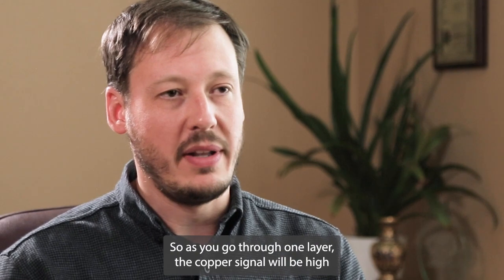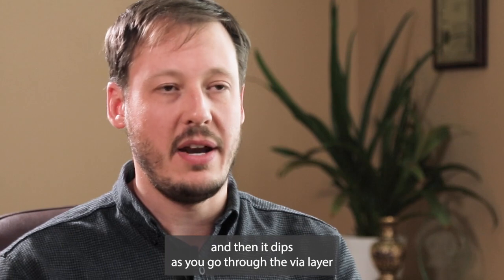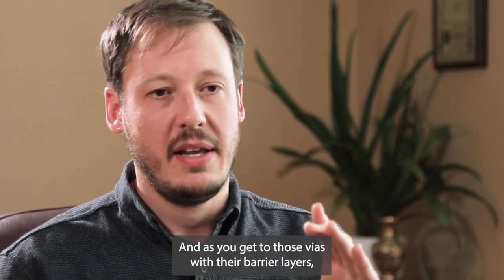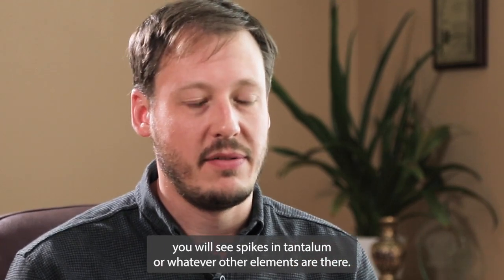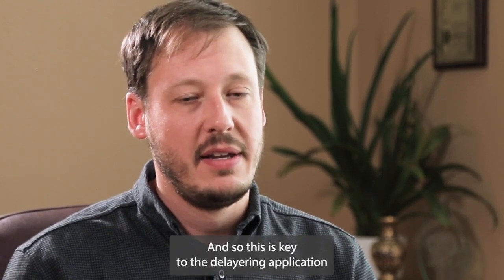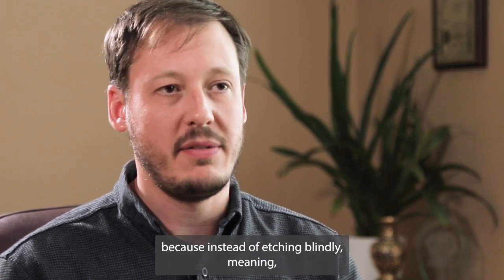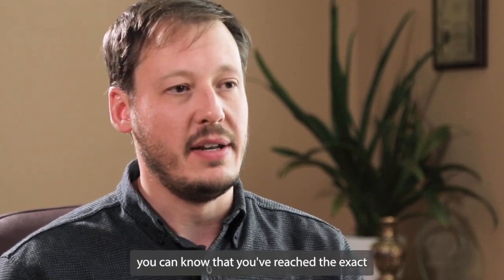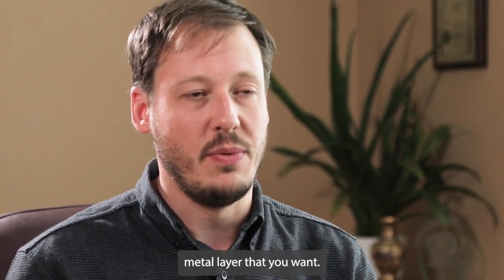So as you go through one layer, the copper signal will be high, and then it dips as you go through the via layer, and then it comes back again through the next trace layer. And as you get to those vias with their barrier layers, you will see spikes in tantalum or whatever other elements are there. And so this is key to the delayering application because instead of etching blindly, meaning you have to frequently vent and inspect the chip to see if you've etched far enough, you can know that you've reached the exact metal layer that you want.